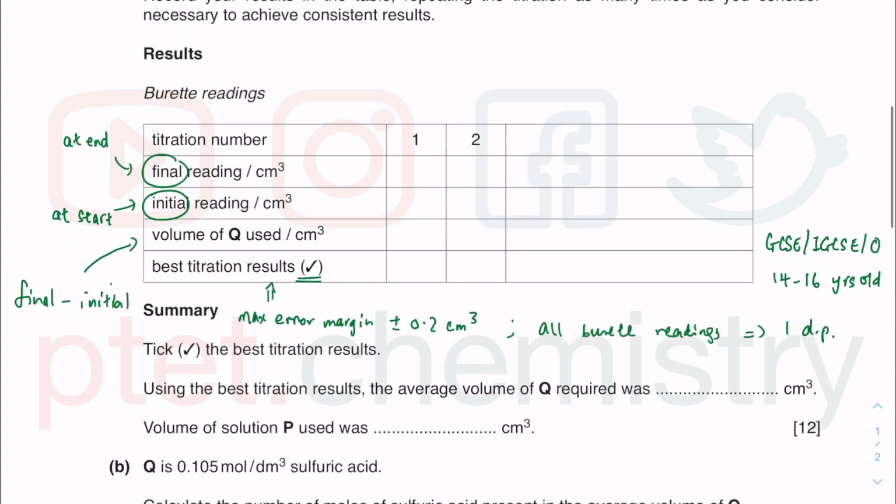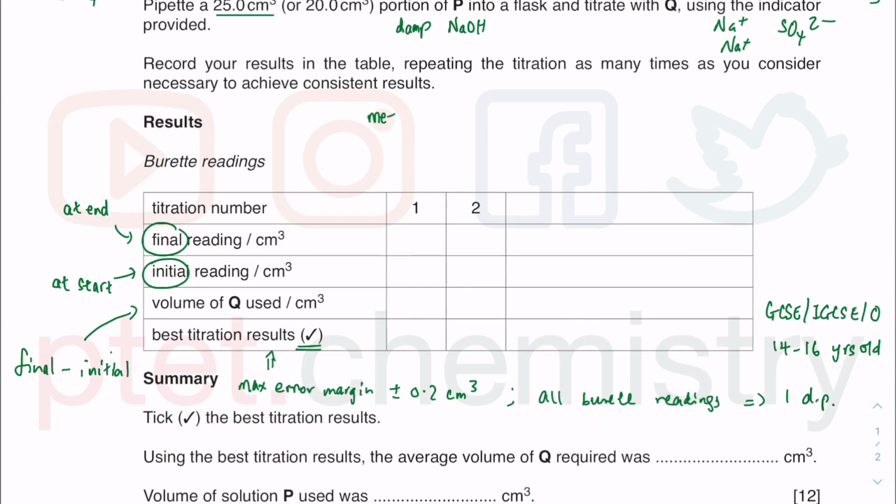Whether I have the opportunity to actually put in what I've recorded is another thing for debate, because I need to try and find that video. But there are many other acid-base titrations using methyl orange indicator. So here we're using methyl orange indicator. There is one on the HCl and NaOH titration experiment, which I have recorded fully, and you can catch that tutorial if I have not had a chance to append my actual experimental video onto this particular tutorial.